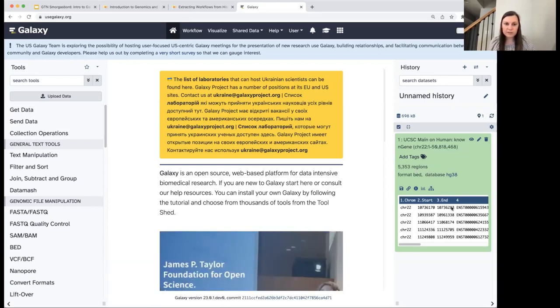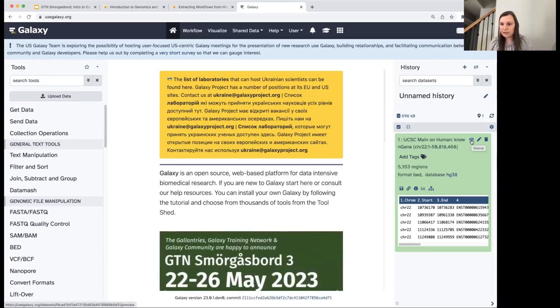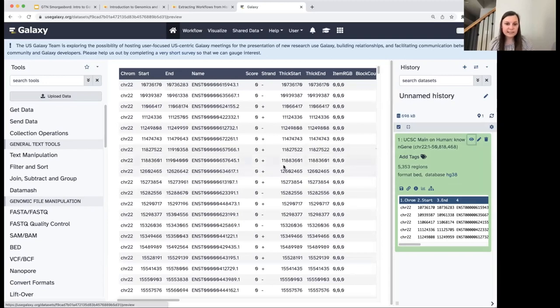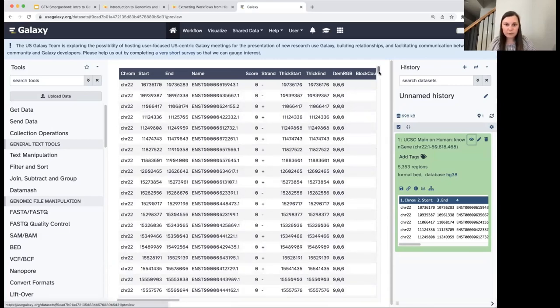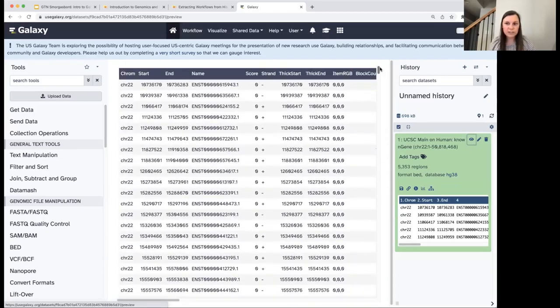If we want a deeper look at the data, we can click the eye icon to get a fuller view in the main panel. We see chromosome 22, start and end positions, and strand information. I'd expect all rows to show chromosome 22 if I scrolled through the whole file. That strand information in column 6 is going to be really helpful to us.